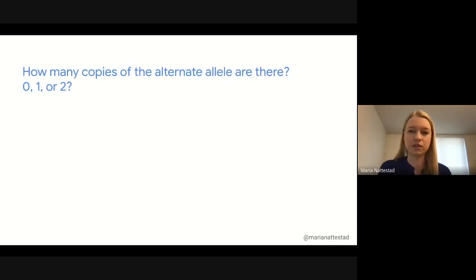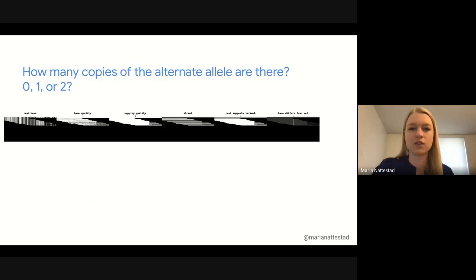Let's play a little game where I'll give you the opportunity to try to call some of these pileup images. I'll do the first slide first so you can see how I think through it. This pileup image, I look at it and see that in the fifth channel, we have read supports variant all lighting up in white, which means ostensibly all of the reads support this variant. I don't see any other issues like base qualities or mapping qualities being bad. So I think this is a two, homozygous alternate.